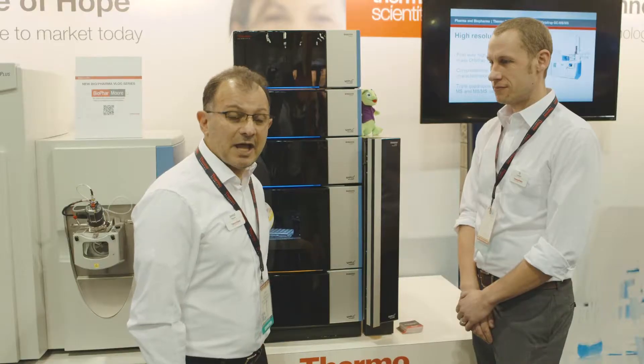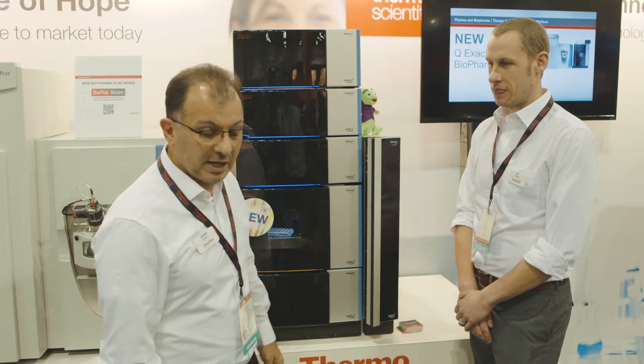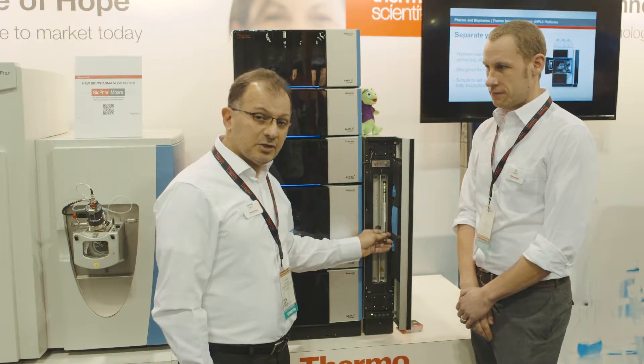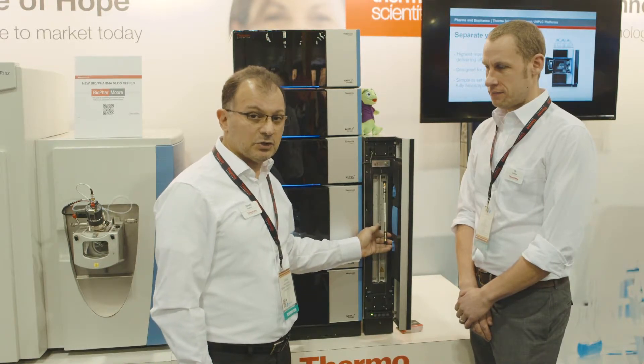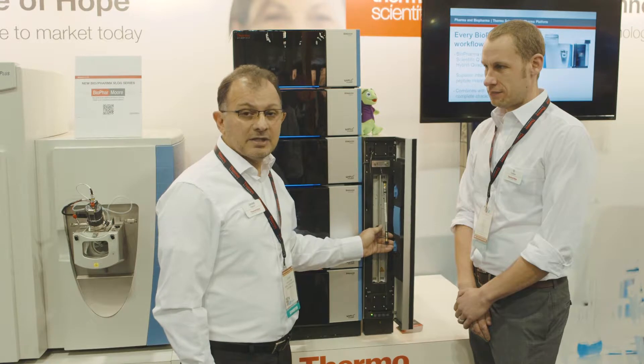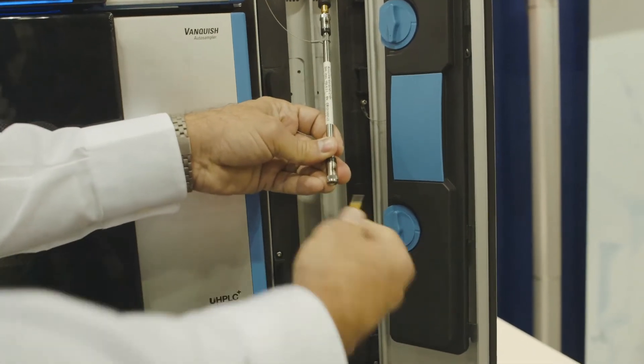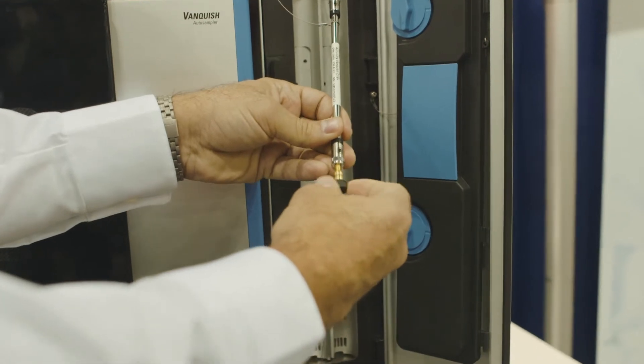I've met many of our customers and they point out one feature that they like more than any other in this HPLC, and that is the Viper connection device. It's zero dead volume, universal — you can use it with any column — and it's rated to UHPLC pressure. Very simple to use: just use your fingers to make the connection and it's good to go.